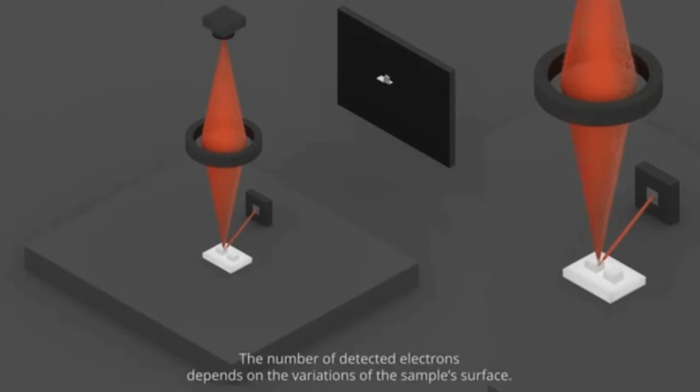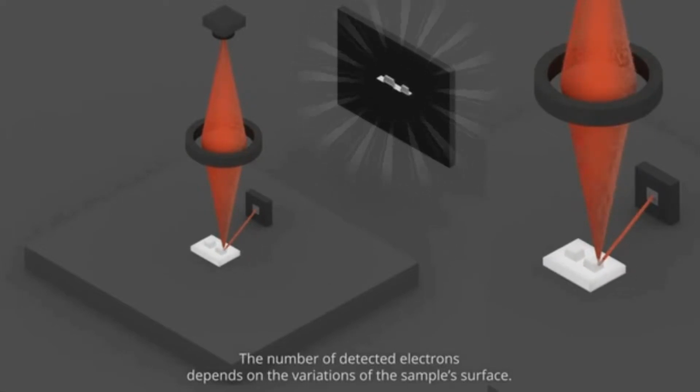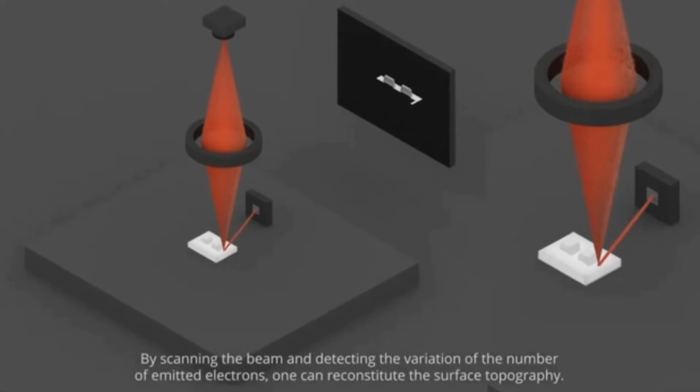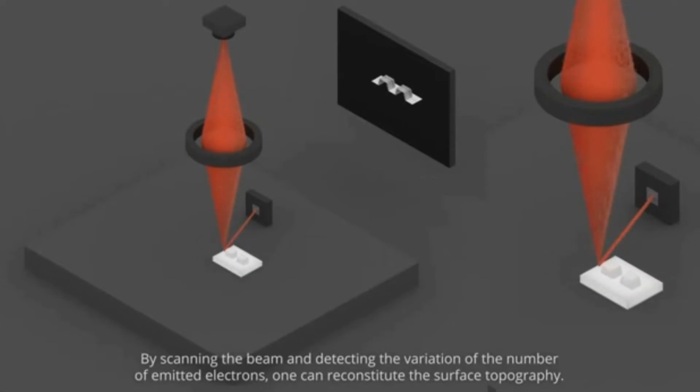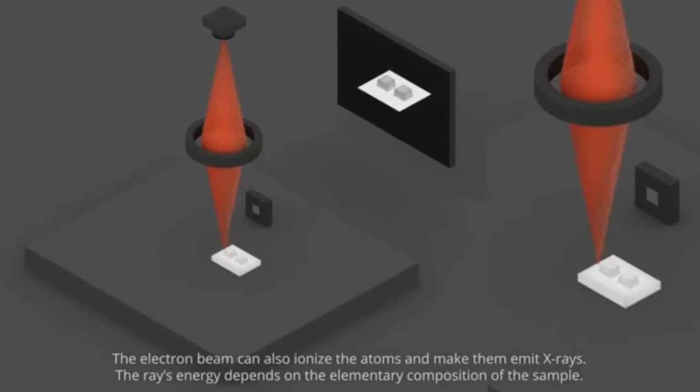The number of detected electrons depends on the variation of the sample surface. By scanning the beam and detecting the variation of the number of emitted electrons, one can reconstruct the surface topography. The electron beam can also ionize the atoms and make them emit X-rays. The X-ray energy depends on the elementary composition of the sample.